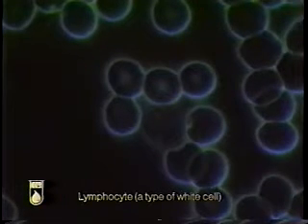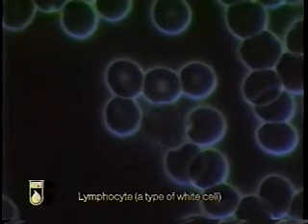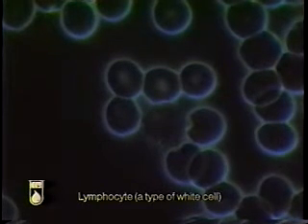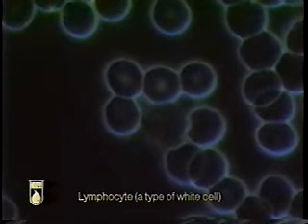Seen along the side of this particular lymphocyte is a bright refractile body. This is a viral aggregate body as described by Naissans. It is not an individual virus, but rather a collection or assemblage of viral materials.